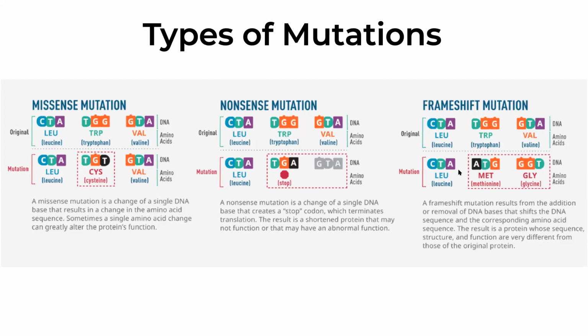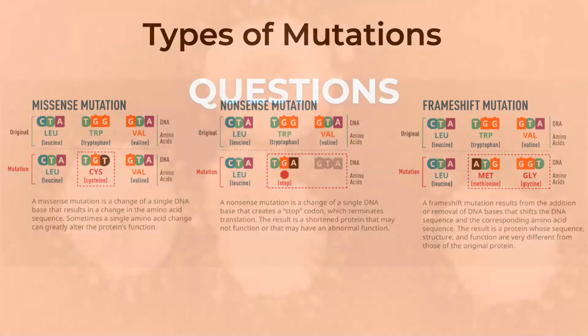And we can observe them by only looking at those places where we have significant evidence of changes from the reference genome. So this critical step of alignment of reads to the reference genome allows us to discover different types of mutations.